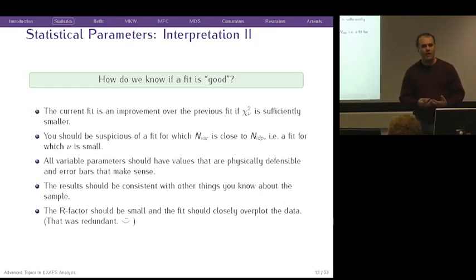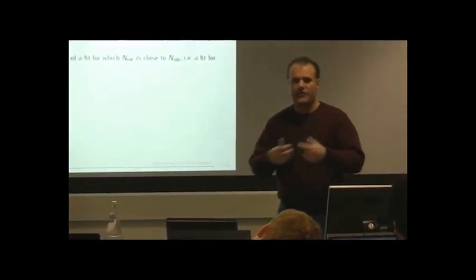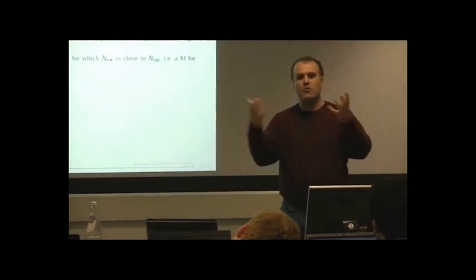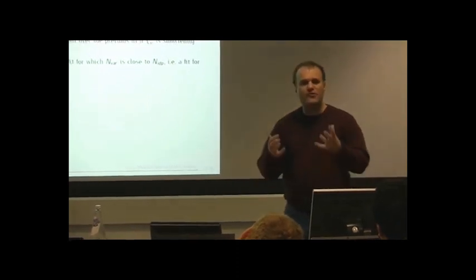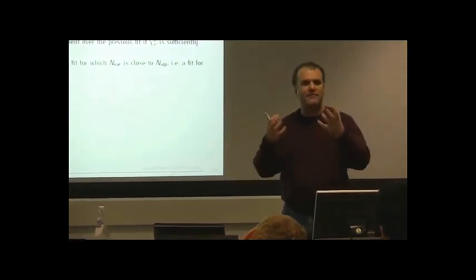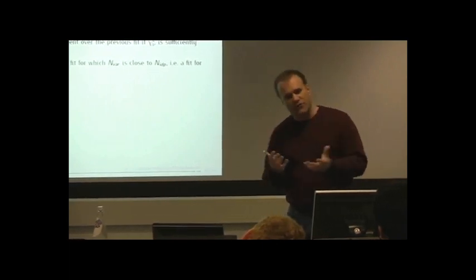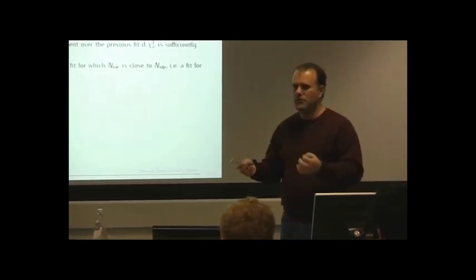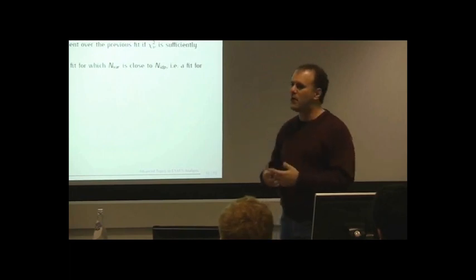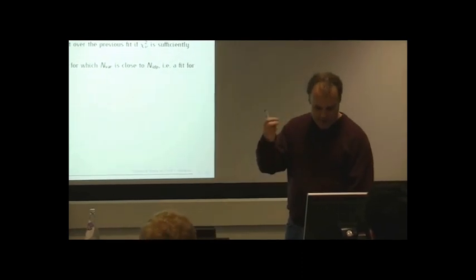And the reason for that is that when you introduce a number of parameters that's very close to the maximal information content of the data, it's likely that the correlations between the parameters will go up significantly, and that all of the parameters will be very ill-determined. The error bars will probably be very large. In general, it's best to do a fit using as little of the information as possible. That is, to make all of your parameters as robust and strong in the fit as possible.